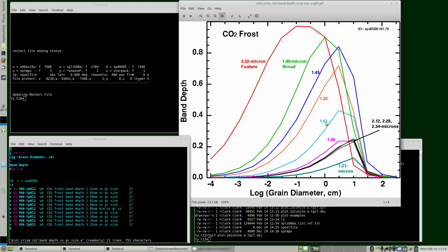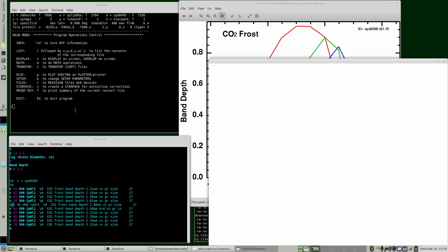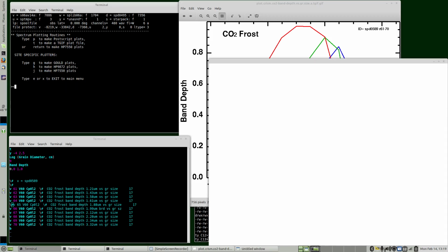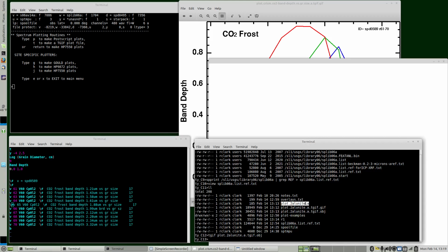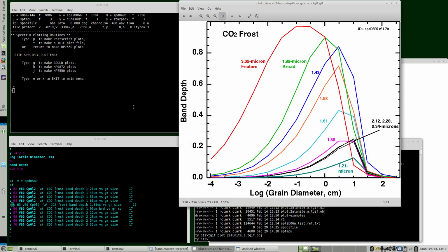If you want to turn one off or something, you can just come down here and comment it out and regenerate the plot, or turn it back on, or maybe you want to add something else, just add it to this file and re-execute. In Specpr, you would just say less than and then the plot name, and it would execute that file again. And in fact, we could do that. We have this right here. So we've just re-executed and rebuilt the Tgif file. Then you'd need to edit it and change colors as you want.